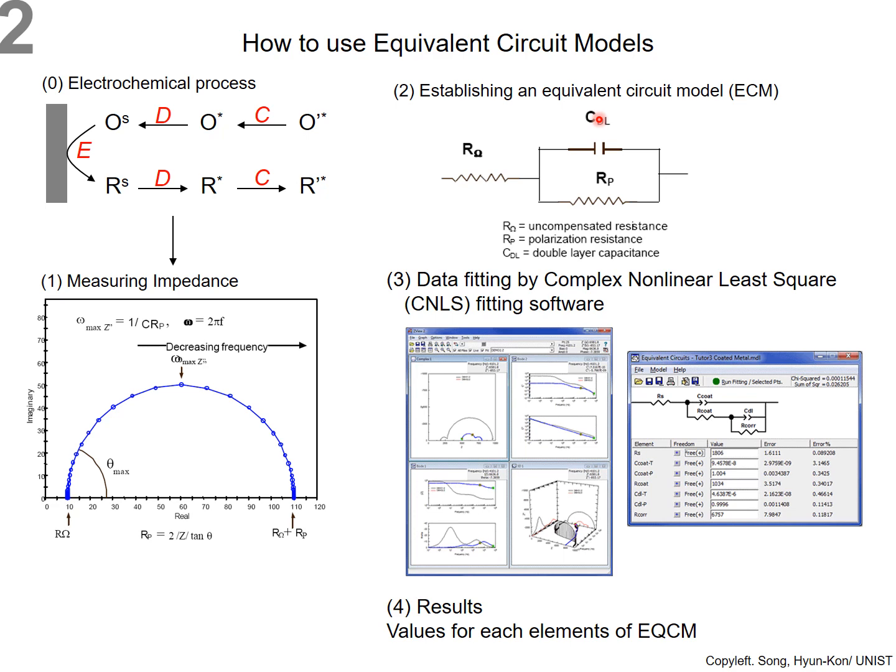For example, if the charge transfer resistance is smaller than that of the other system, it means you have developed very good, fast kinetics for charge carriers or redox active species. Or if you have very large values of ohmic resistance, the ionic conductivity of your solution is problematic or something like that.